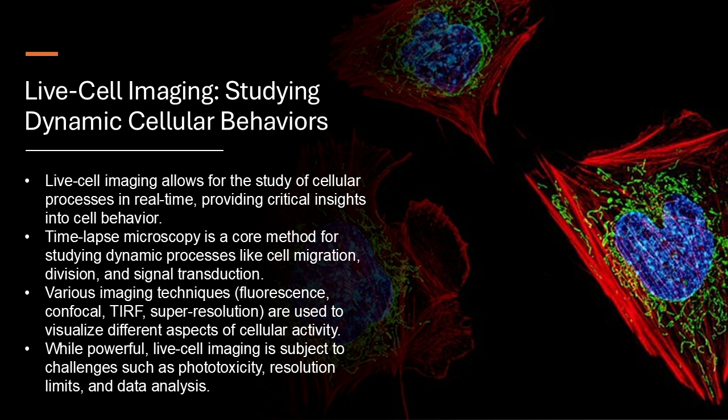Well, let's move from movement to another fundamental process, cell division. Remember that intricate dance of chromosomes we talked about? Of course, it was mesmerizing. Well, live cell imaging is allowing us to study this process in unprecedented detail, particularly in the context of developmental biology. Developmental biology, you mean how organisms develop from a single fertilized egg? Exactly. Cell division is the engine of development, and by observing it in real time, we can gain a deeper understanding of how tissues and organs form, how cells specialize into different types, and what happens when these processes go awry. It's incredible to think that we're not just watching cells divide, we're essentially watching the very foundation of life being built. It is truly awe-inspiring.